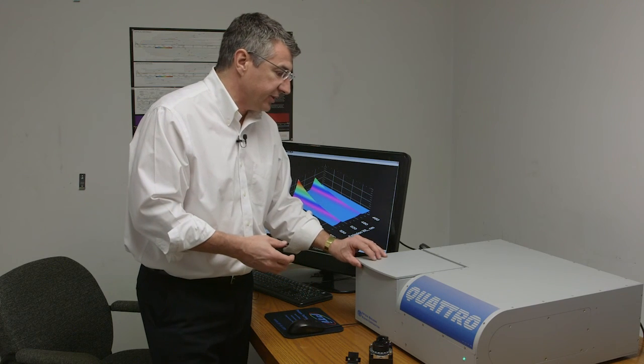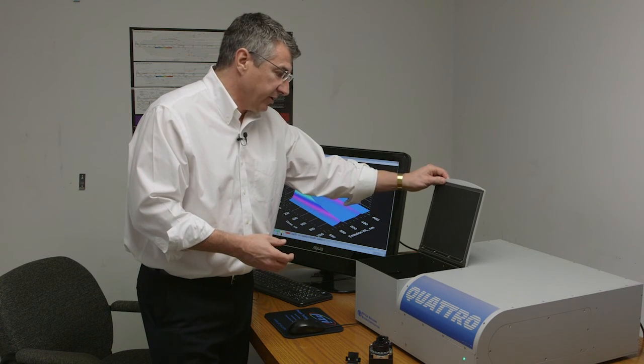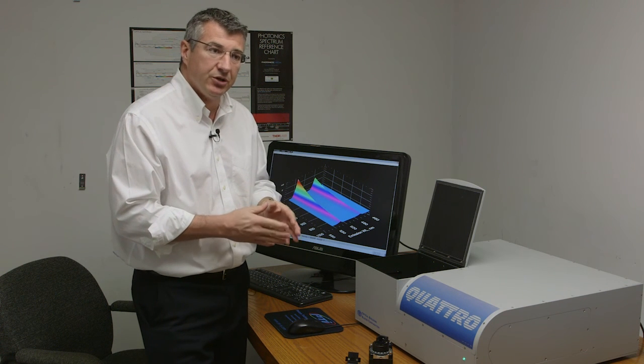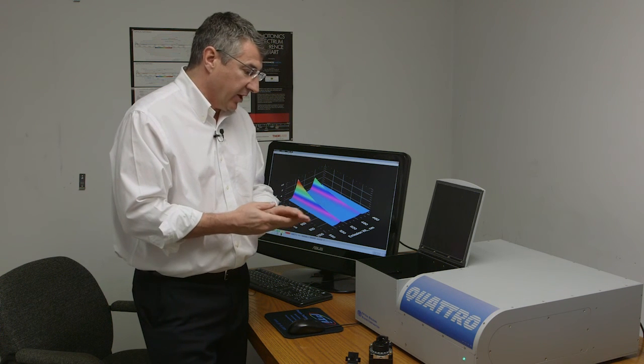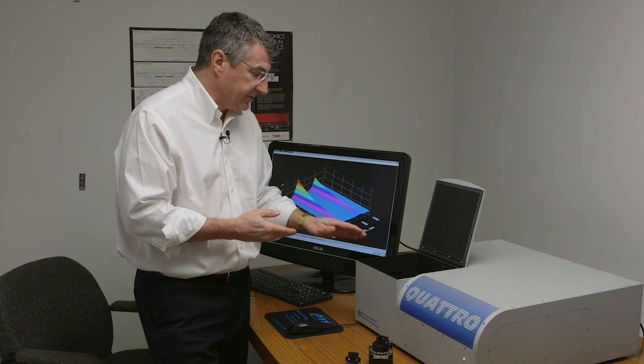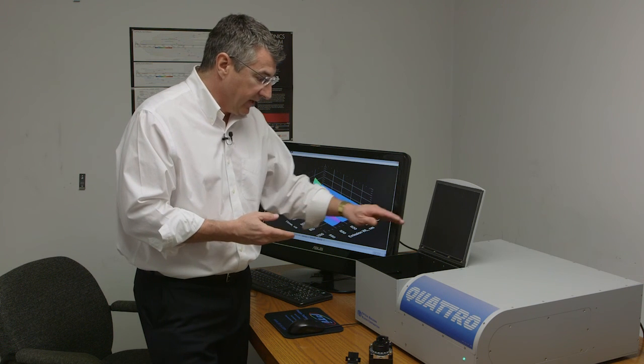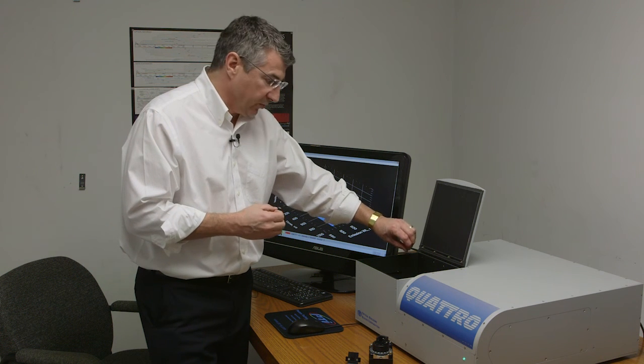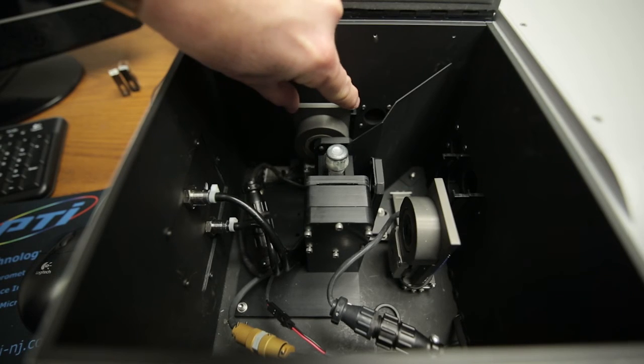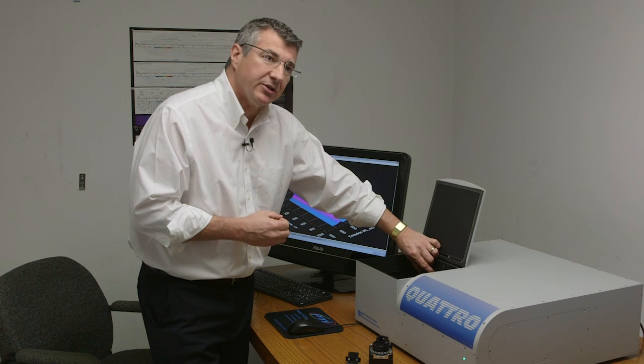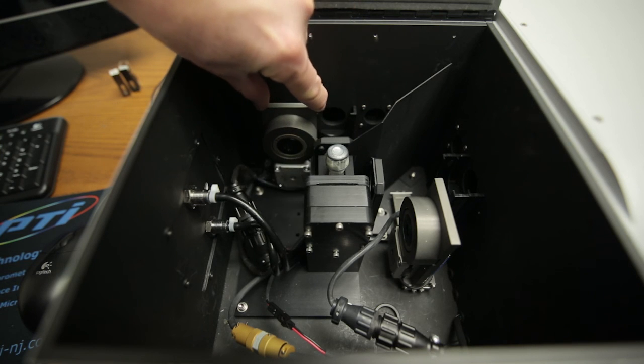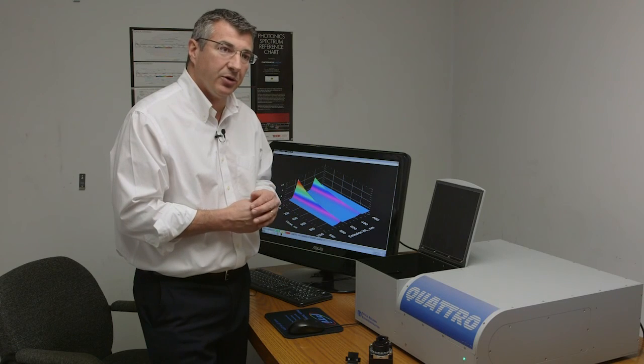And lastly as well, we have accessories in the instrument which are automated polarizers. If you're interested in studying rotational effects, then we have automated quartz and automated film polarizers. This instrument is actually equipped with them and they're already installed in the instrument and ready to go, and the user just simply has to slide across a little track inside the sample compartment and put the polarizer in place for use or pull it out of place when you're not using it. It's a very, very simple thing to work with.